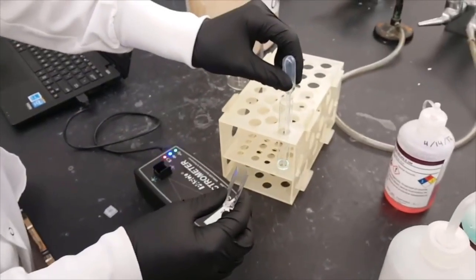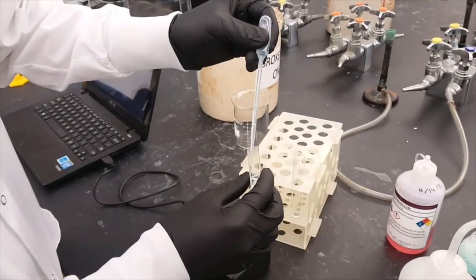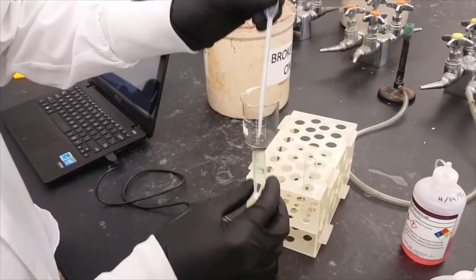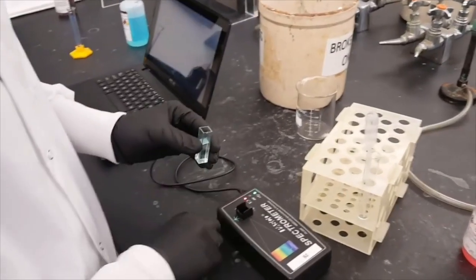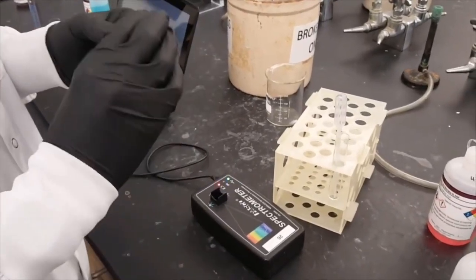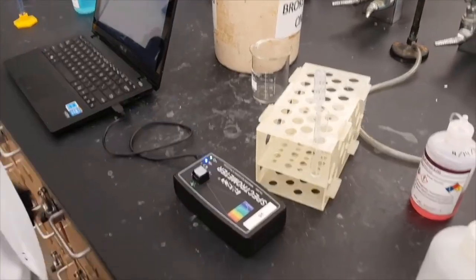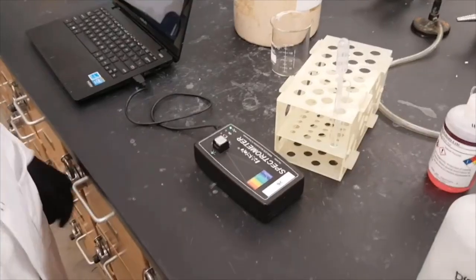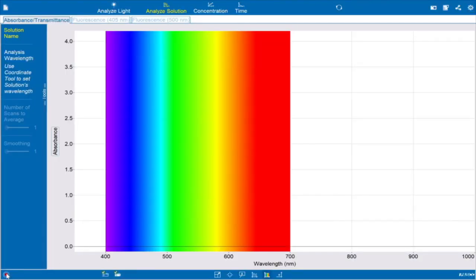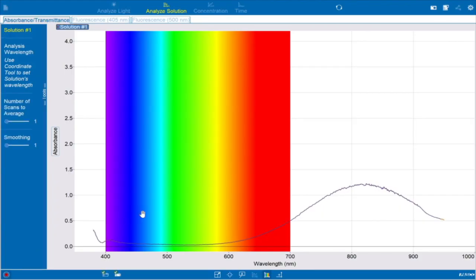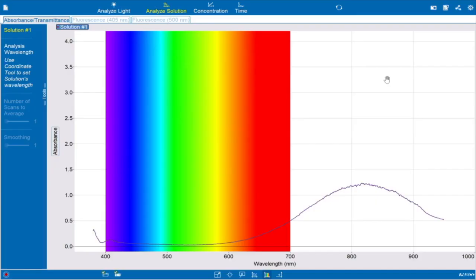To begin the experiment, measure about 3 milliliters of the 0.05 molar copper 2 nitrate solution and put it into your cuvette. Put a lid on top, invert the cuvette to mix the solution, and then place it inside the spectrometer — again, aligned properly with the transparent side facing the white light symbol. In the spectrometry program, click on the red circle at the bottom left to begin measuring the spectrum. When the spectrum appears, the red circle will change to a red square. After a few seconds, click on the red square to stop the measurement. Then remove your cuvette, empty the contents into a waste beaker, and rinse out your cuvette with distilled water before adding the next solution.